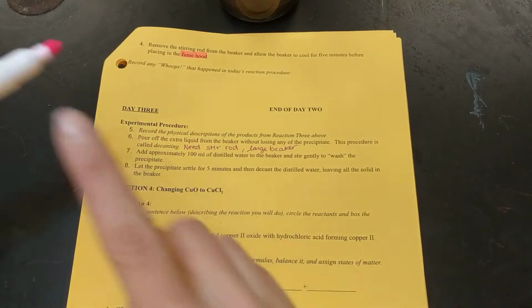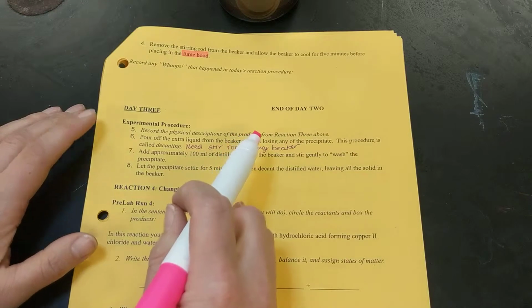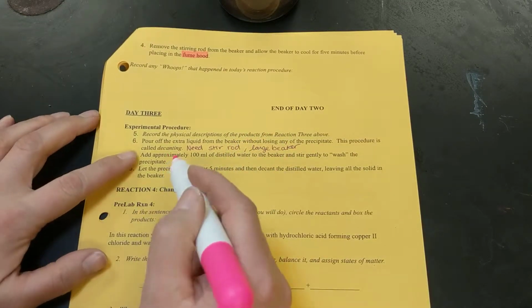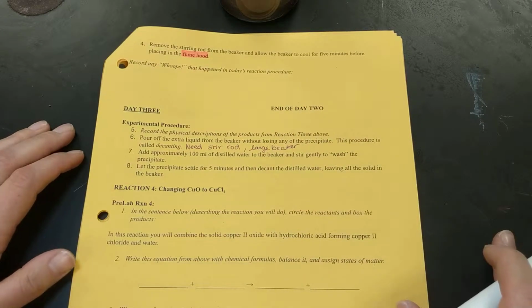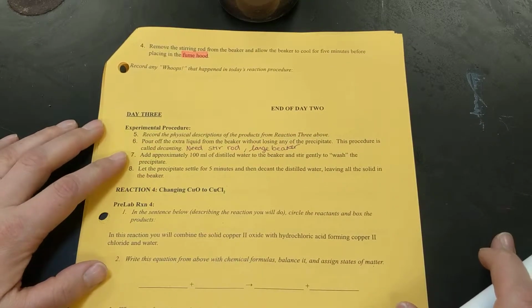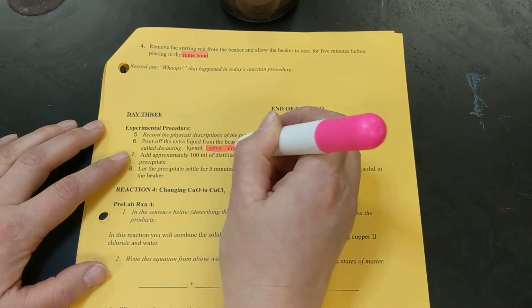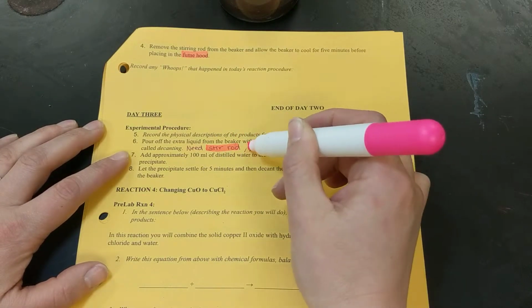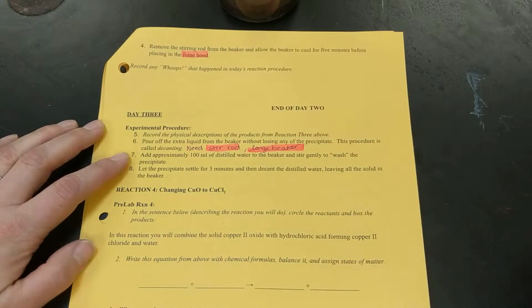So the materials that we'll need, it says that we want to record the physical descriptions of the products from reaction 3 above, so we record what our beaker looks like, then pour off the extra liquid from the beaker without losing any of the precipitate. This procedure is called decanting. To decant, we will need a stir rod, and we need a large beaker to pour off the liquid we want to decant off, and I'll show you how to do that.